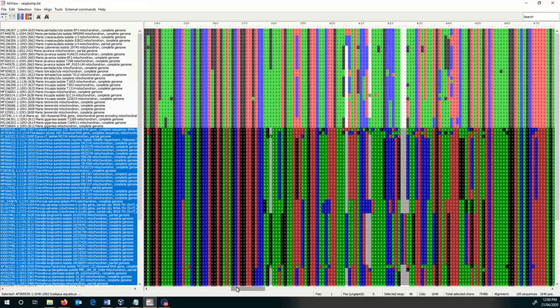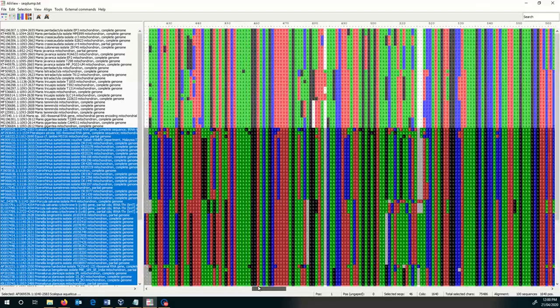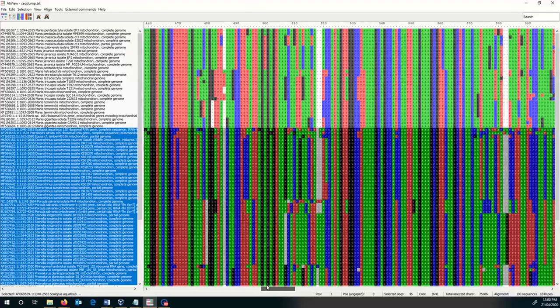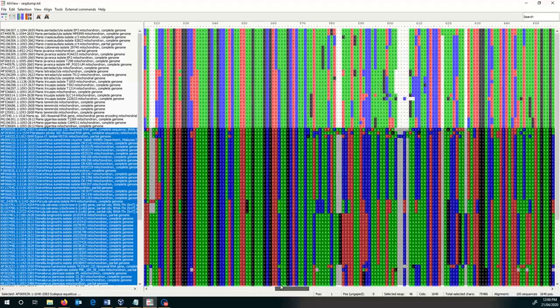So I'm going to scroll along a little bit further and see if we can find something a bit more pangolin friendly and unfriendly to other mammals. Where are we going with this? Once again, this would be a good species identification region.